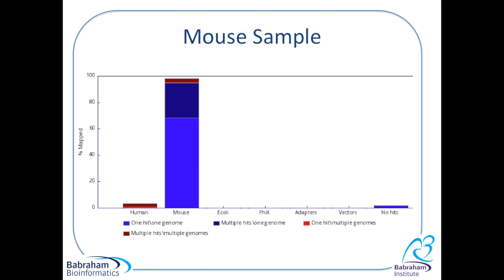The vast majority of reads which mapped to the mouse genome mapped uniquely to that genome and didn't map to any of the others. However, there is a small proportion of reads, i.e. the red ones, which map to the mouse genome and one other, i.e. they map to the human genome. But what is important is that no reads mapped uniquely to the human genome.